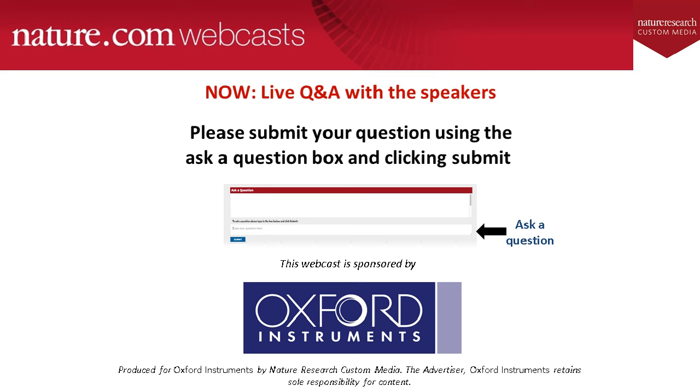Excellent. Thanks, Louise. Next question asks, do you have any suggestions for making a 3D EDS analysis of biomass materials successful at room temperature? Can either of you help with that question? Yeah, I think I can. So it does depend on the materials. I'm not entirely sure which materials are being referred to, but there are a variety of options to do 3D EDS.